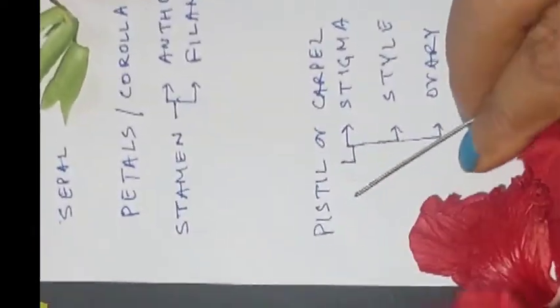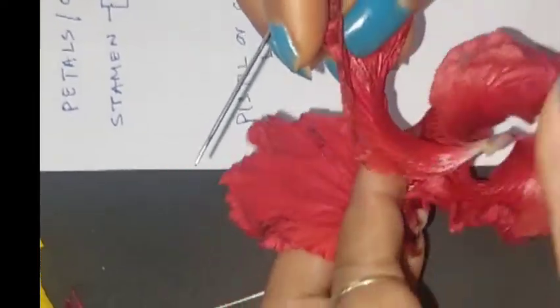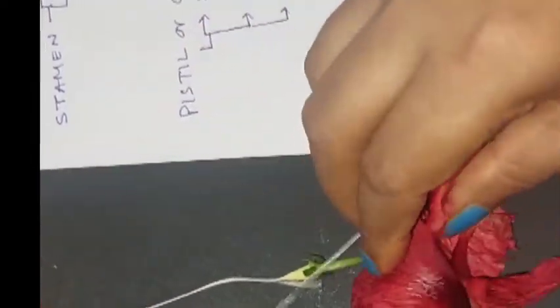This is petals which is brightly colored part of the plant to attract the insect for pollination. Petals help to attract for pollination. Let's understand the stamen.